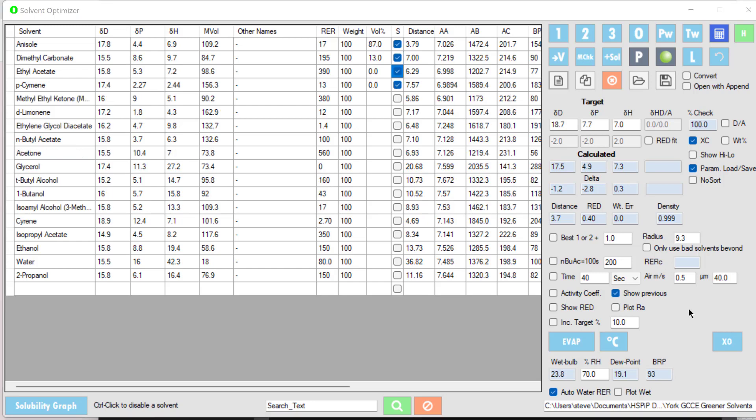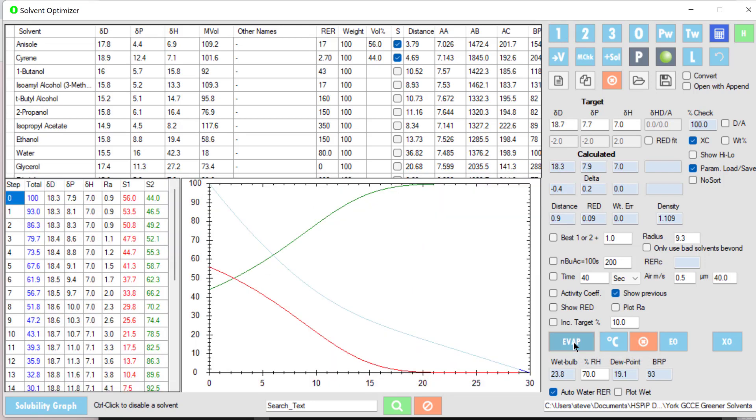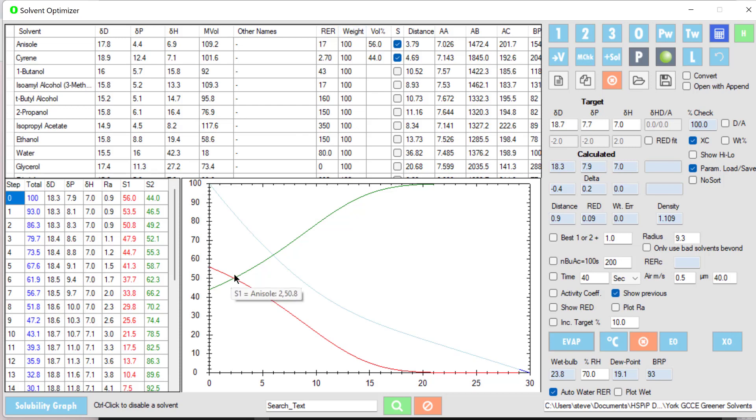Talking of evaporation, let's go back to our blend of two solvents and see what happens when it evaporates. We see that the anisole starts off at a higher proportion, 56%, and it decreases relatively because it has a higher RER. The cyrene increases, and here is the total decreasing over time.